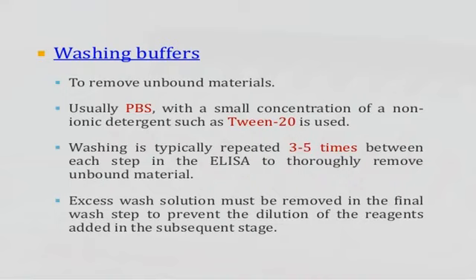يعني شلون اوخر this washing buffer؟ قلنا نقلب البليت على ورق من الكلينس ونحاول انه نضرب البليت فد 3 مرات 4 مرات حتى تروح من الاكسس washing fluid. That will prevent the dilutions of the reagent added in the subsequent stage. لأنه أنا إذا كان عندي موجود washing buffer ما تخلصت منه هذا حيضيف إلى ويغير لي بالconcentration اللي أنا مثلا of the primary antibodies اللي حضيفه بالخطوة اللي قادمة.